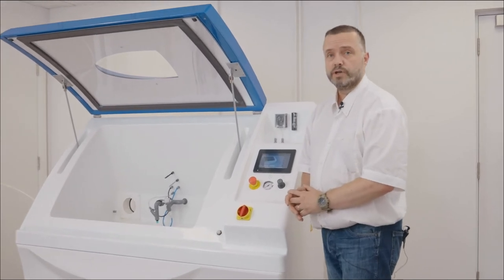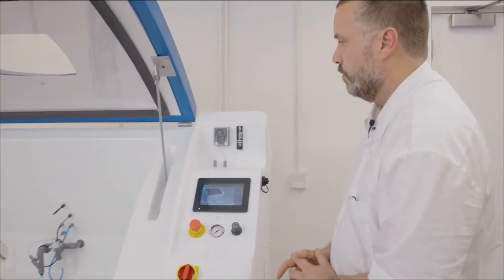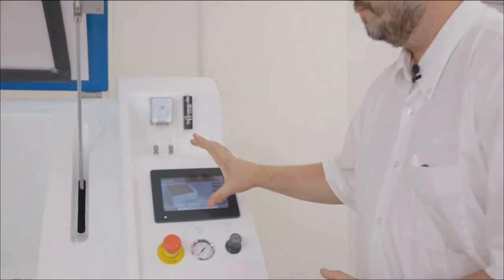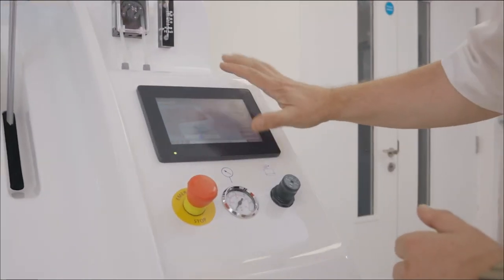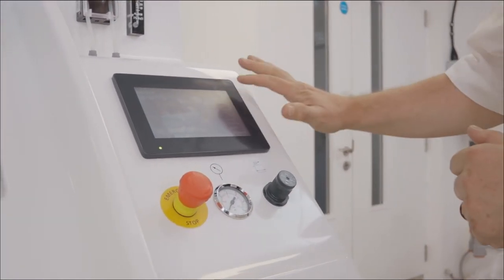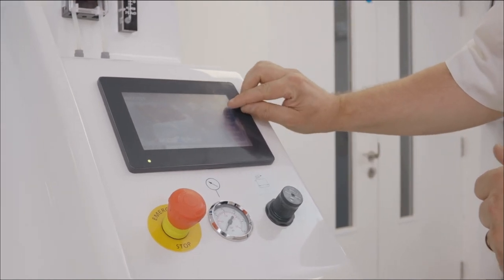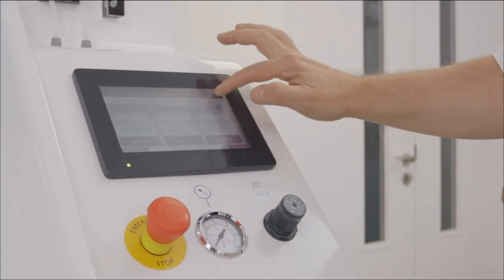Ascot's cyclic corrosion chamber. On the right of the chamber we have the control system, touchscreen HMI, multi-color, multi-language giving access to the multiple features of the chamber.